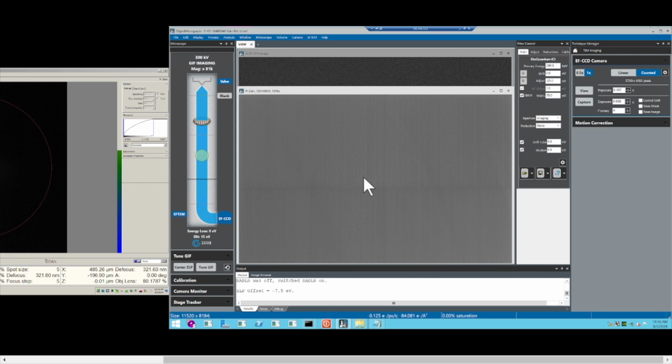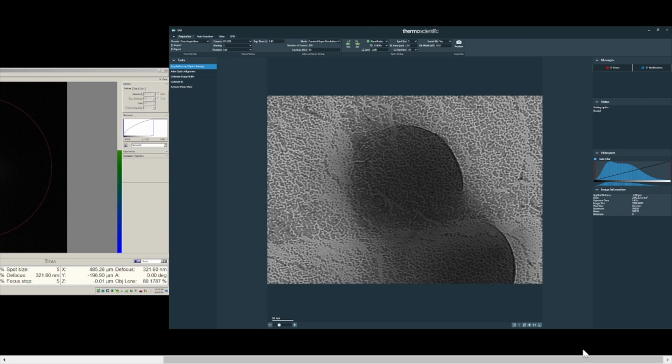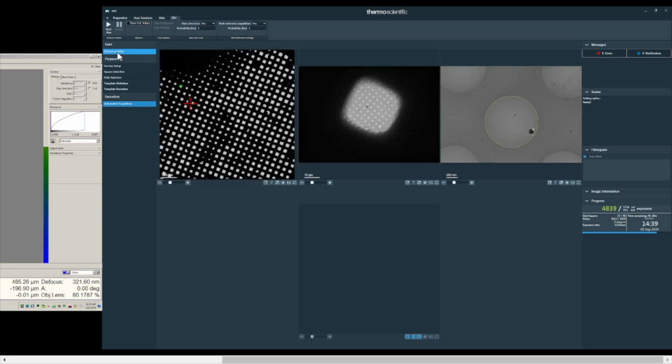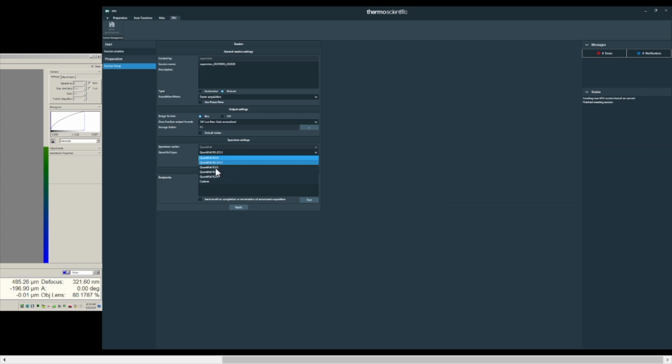Okay, now we can switch back to the EPU software. So click this EPU icon. Then the right monitor will be switched to the EPU user interface. Now we are going to click the EPU tab, then start a new session. Usually for the naming of the EPU session, we use the data proposal number and the date. Also, if you have more than one grid, you'd better include the grid information here. Okay, after we set up all the parameters, we click create.